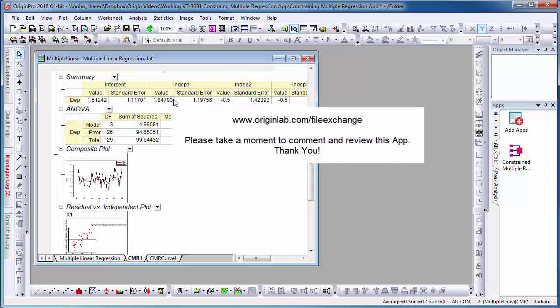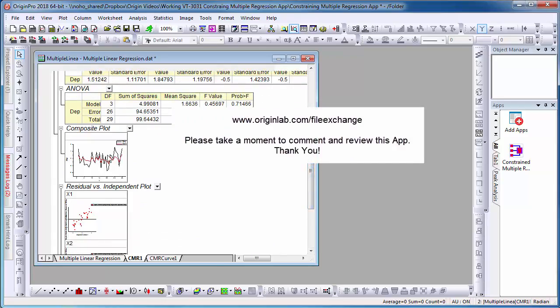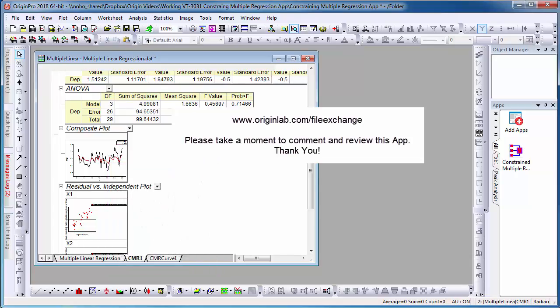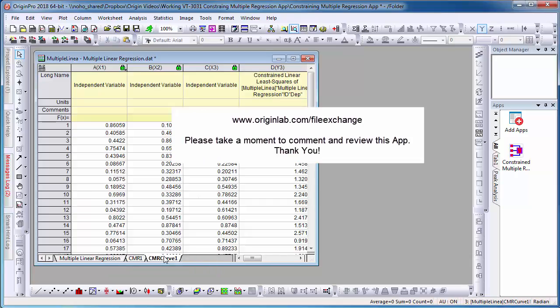To find out more about this app, please visit our website at www.originlab.com/fileexchange. As well, if you have a moment, please comment and review this app. Thank you.